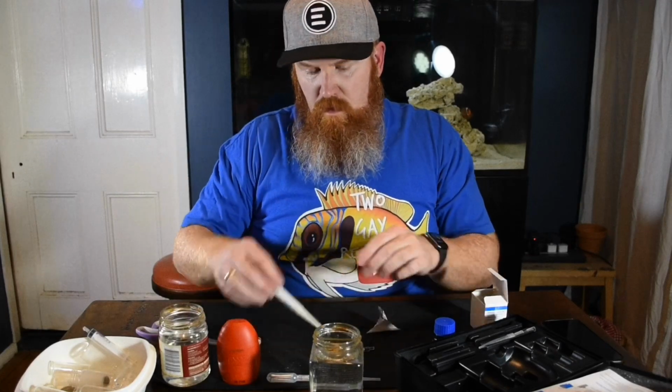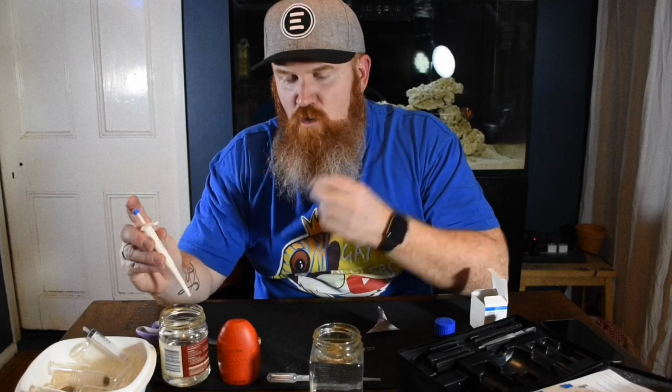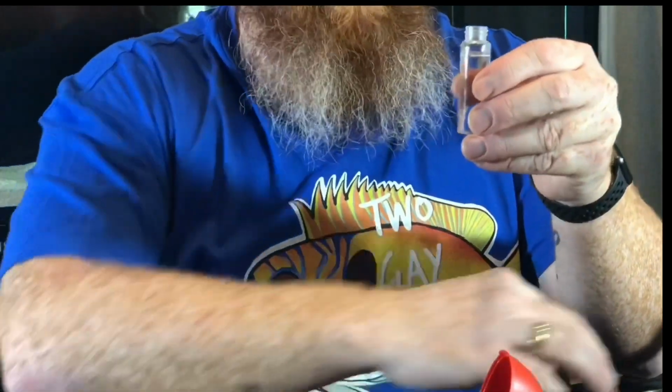Grab this thing, and I don't know what it's called, but it's a pain in the ass, and I always test it because I always feel like I'm going to get it wrong. You've got to basically put that much of the salt water into the checker. So the actual salt water that you're testing, you put in all of the salt water.